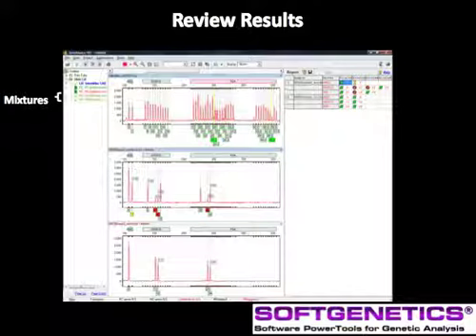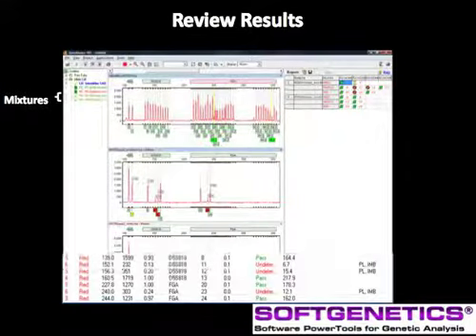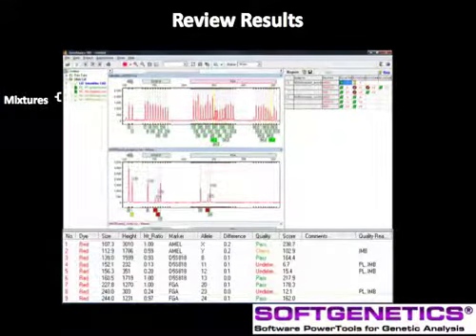As seen in the peak table, the quality reason is PL, greater number of peaks than expected for the ploidy setting of the panel template. If you prefer not to have these samples flagged red, simply change the ploidy of the panel template to unlimited. This will result in just the imbalance rule being fired for yellow flagging, as is seen here for the Y allele of the amelogenin marker.